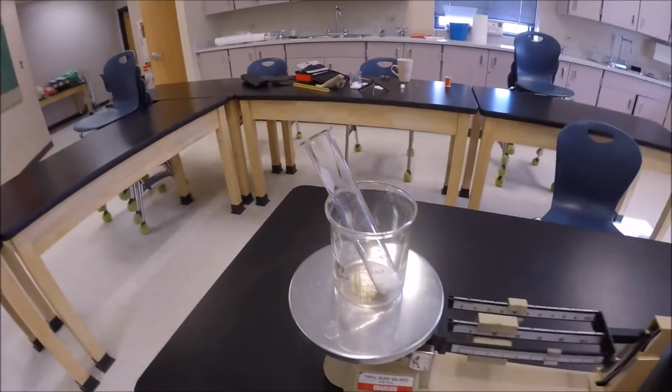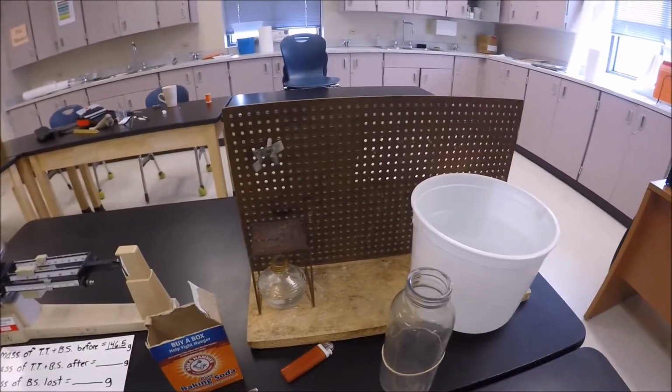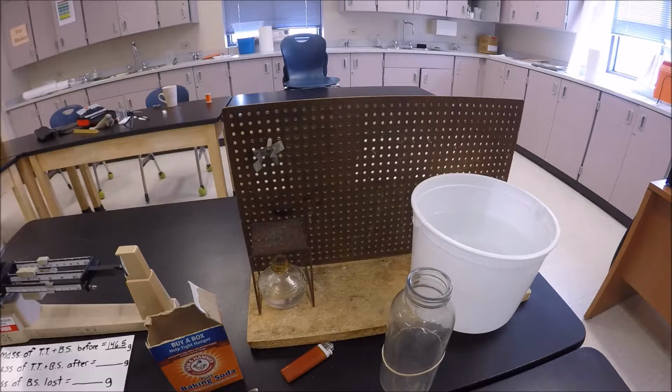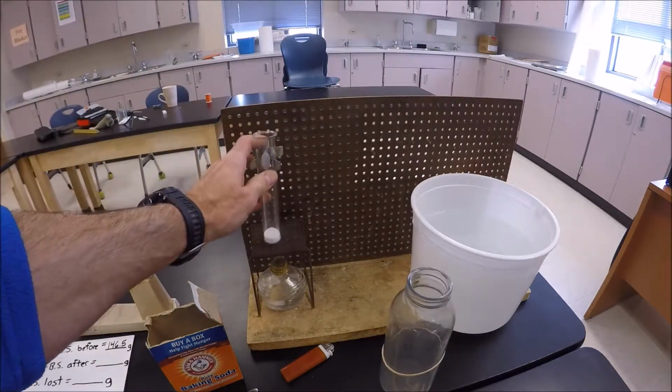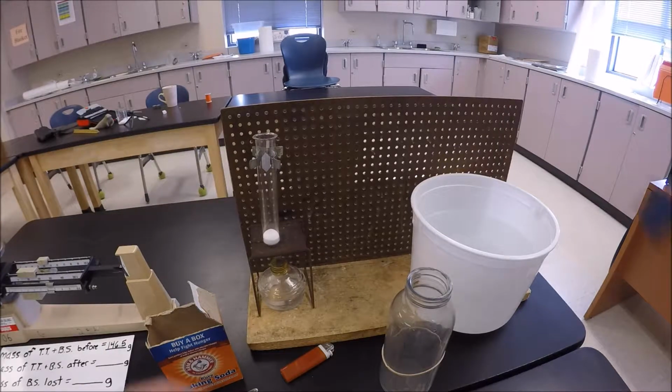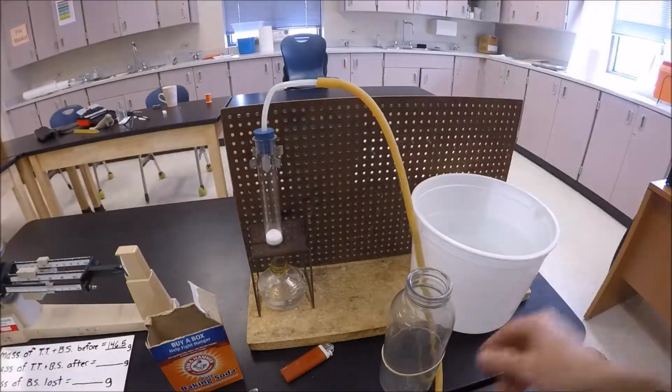So now we're going to go ahead and take that and set it up over here. And I'm going to show you a couple things here. We're going to pause for a second, but we'll take the baking soda, we'll snap that into this little clip here. Then we're going to go ahead and take what's called our gas retrieval system. We'll snap that in tight there.